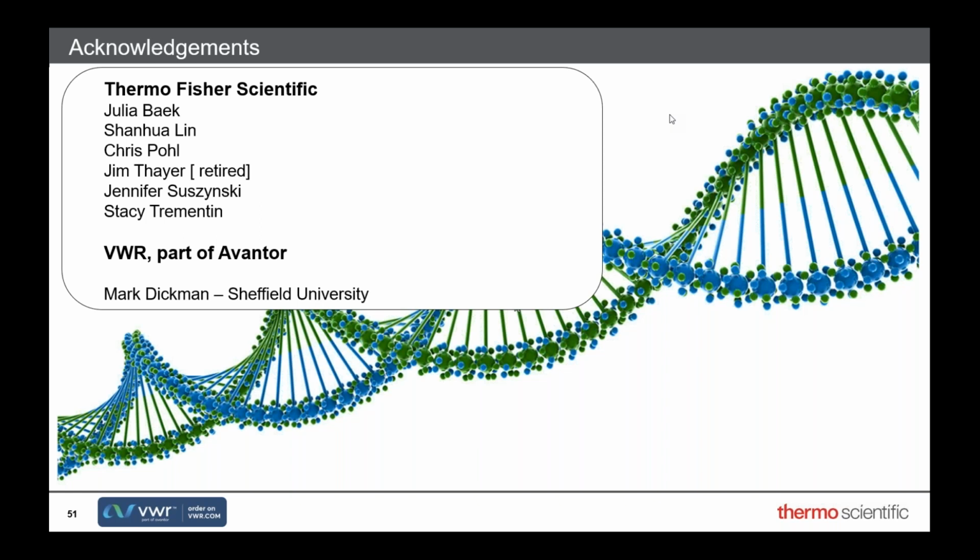You can try having a look at how these things fly. When you've got protein sequences and peptides, they fly very differently in the MS. And again, you can get big peaks and very small peaks that do not like the MS at all. With the DNA separations, whether it's a 20-mer or a 22-mer, it's going to fly in that MS pretty much the same. It's the same sort of molecules, so you haven't got as big a problem with relative quantitation as you have with a protein or with a peptide. But I'd have a look at that and see what the relative separations look like.